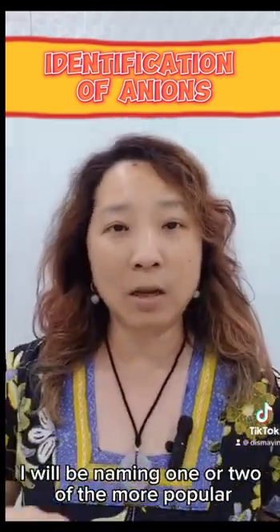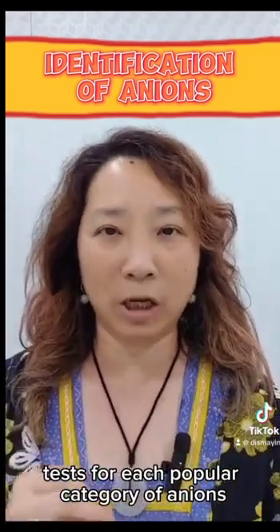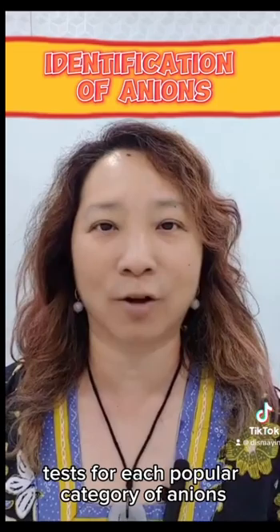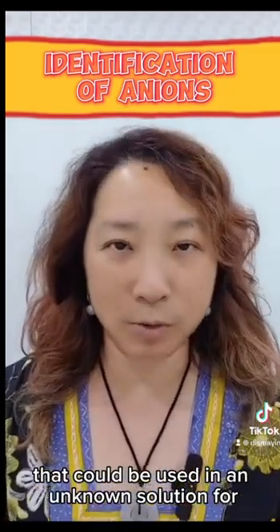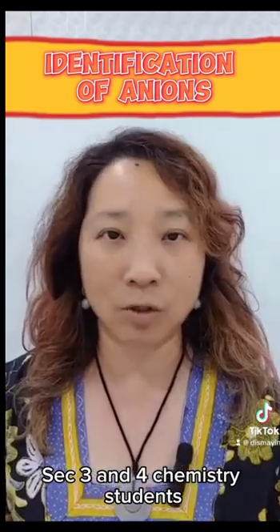I will be naming one or two of the more popular tests for each popular category of anions that could be used in an unknown solution for Sec 3 and 4 chemistry students.